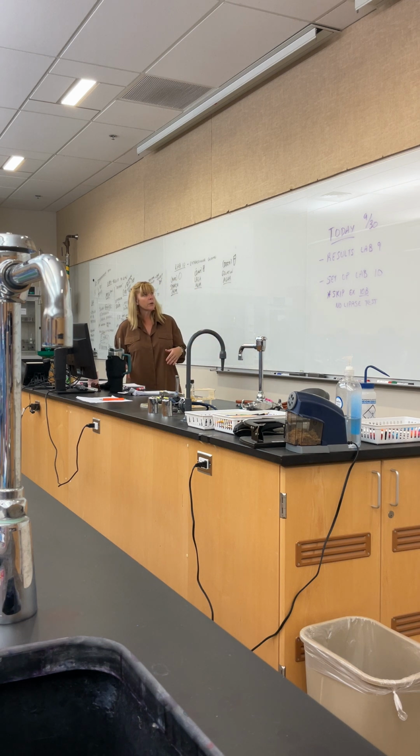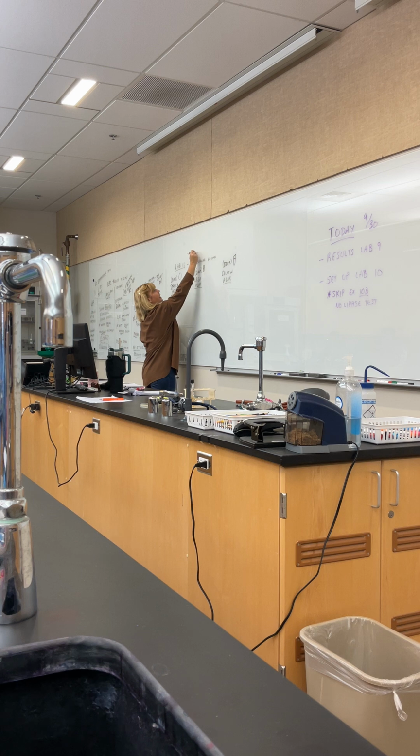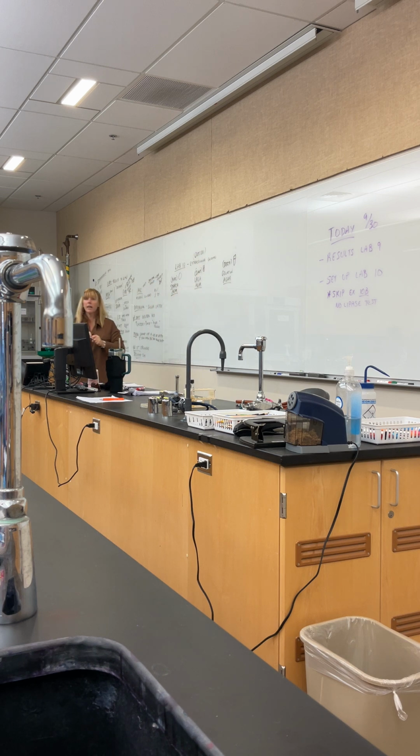Lab 10 is going to be looking at extracellular enzymes. An extracellular enzyme, does that sound like it's in the cell or outside of the cell? Outside of the cell, good. So the idea behind extracellular enzymes is sometimes as a bacterial cell, I have lots of food around me, but it's too big to bring in through my cell wall and my plasma membrane.